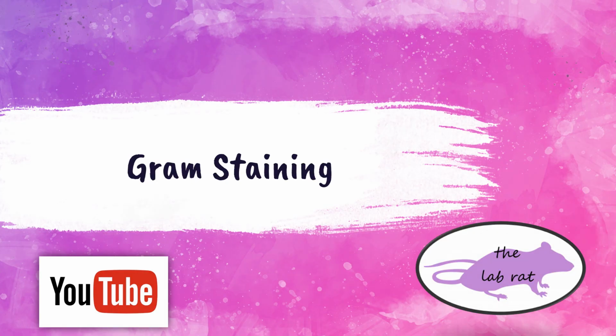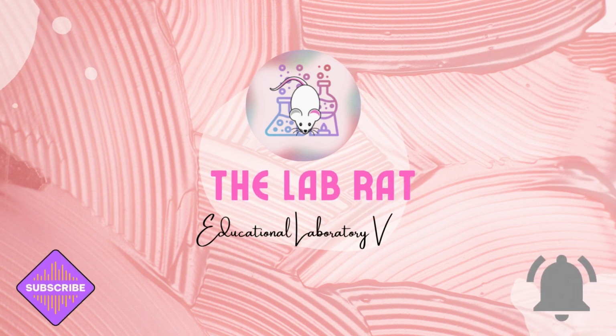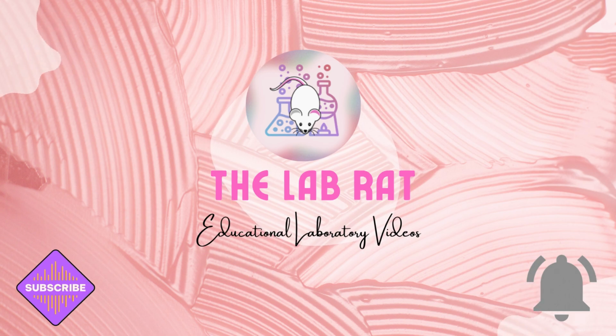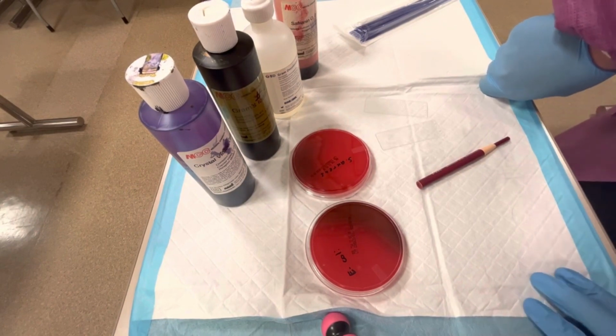In this video I'm going to be demoing for you a gram stain procedure. Alrighty, let's get started. So today I'm going to be demoing how to perform the gram staining procedure.